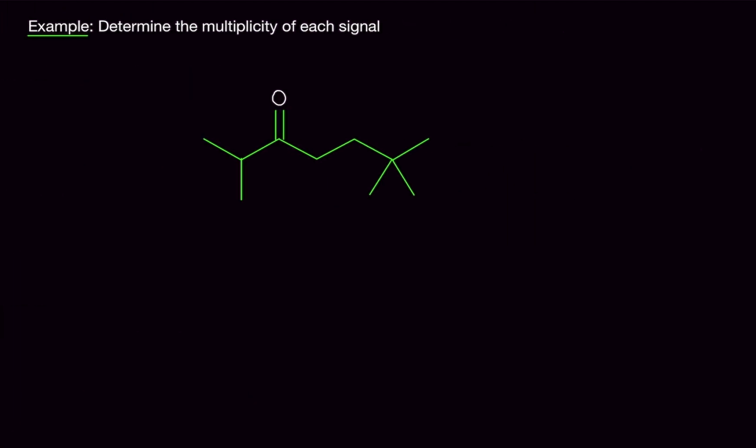So let's do an example. All right, example problem: determine the multiplicity of each signal.